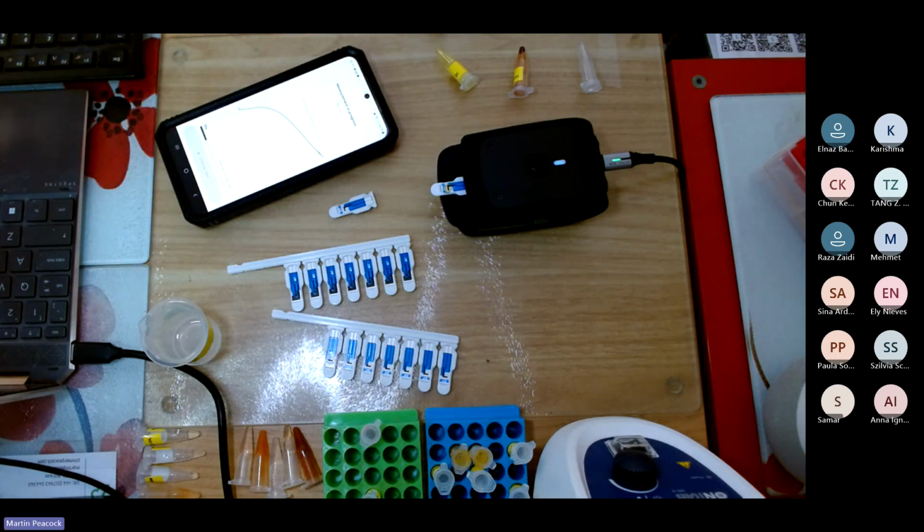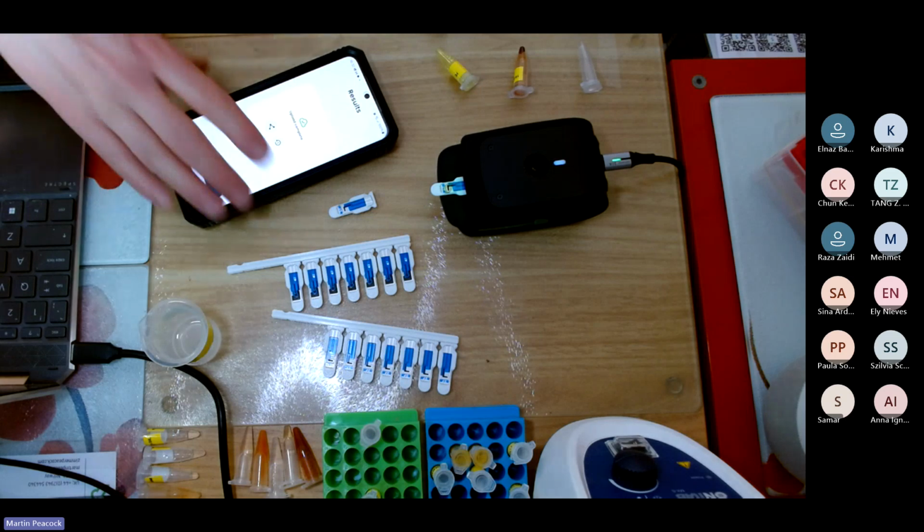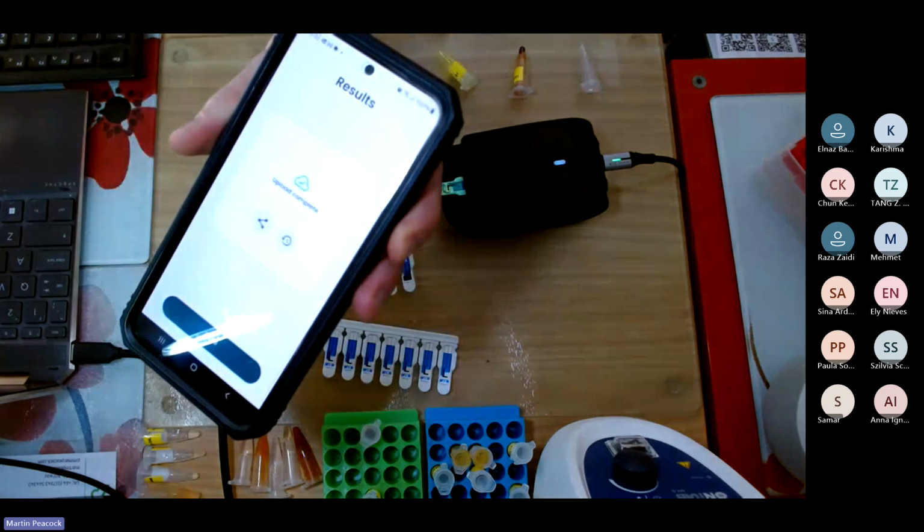So we'll get the oxidation wave. The reason I get the oxidation wave for oxidation of ferro to ferri is because I started my solution, which is ferri, at minus 200 millivolts. So I started by the reduction of ferri to ferro, and then doing the voltammetry, the ferro was then reoxidized back to ferri. Now it says here, upload complete, okay?